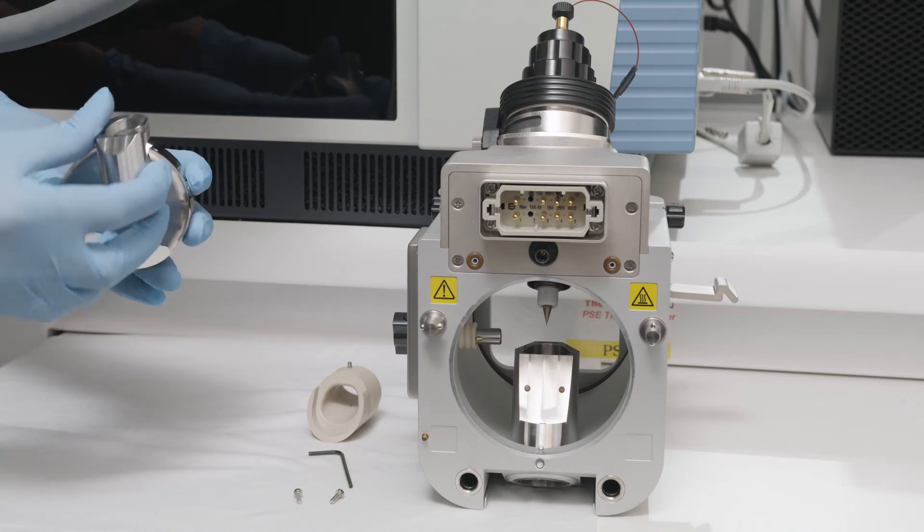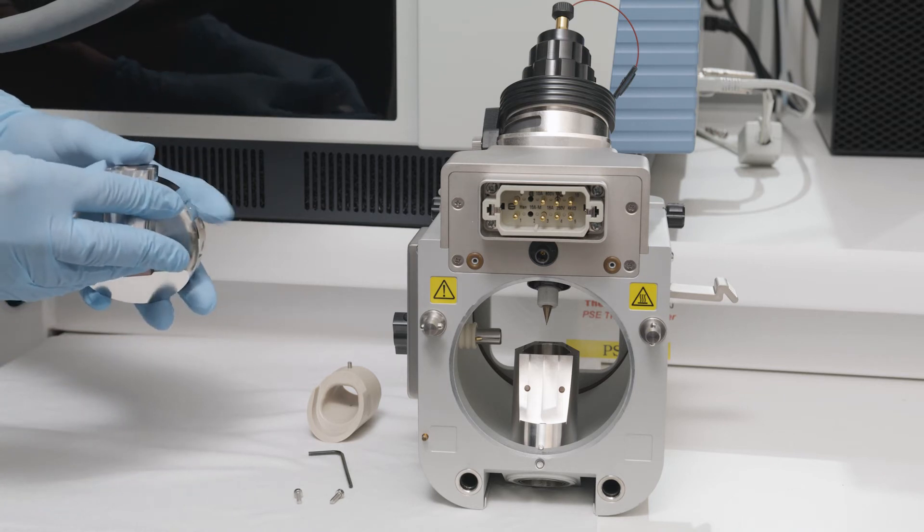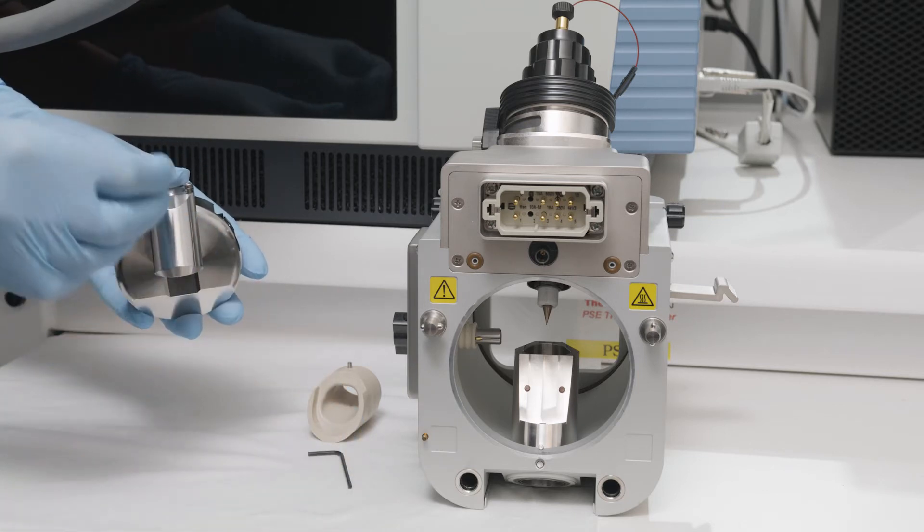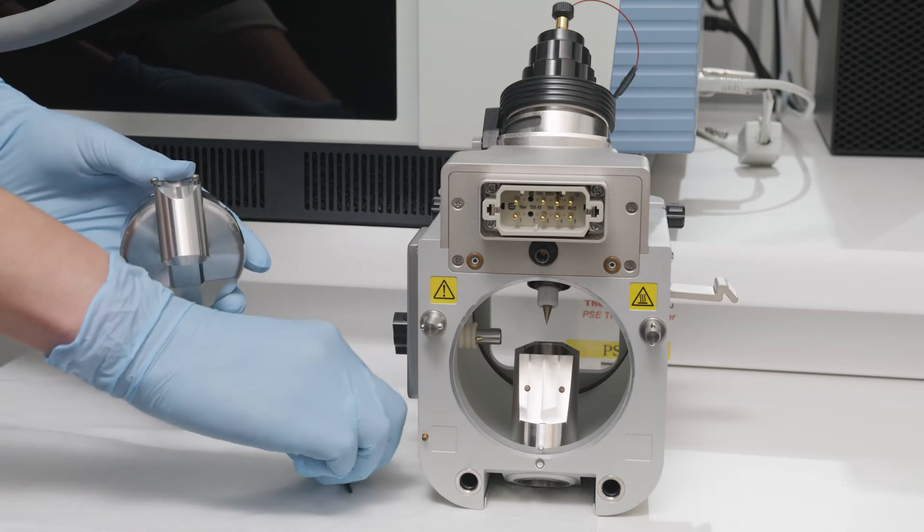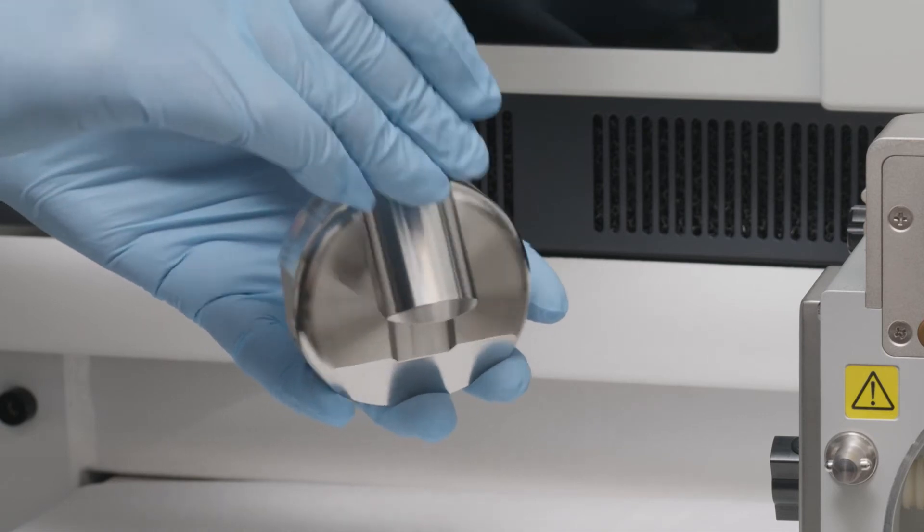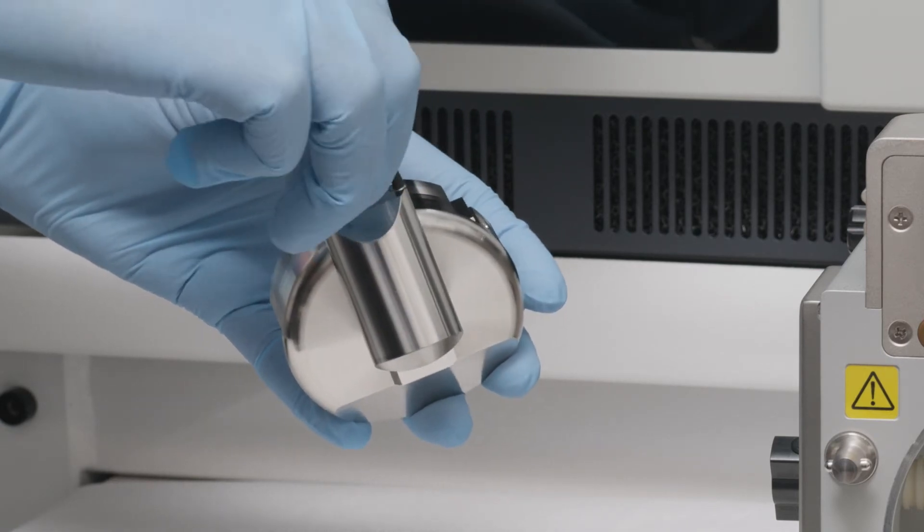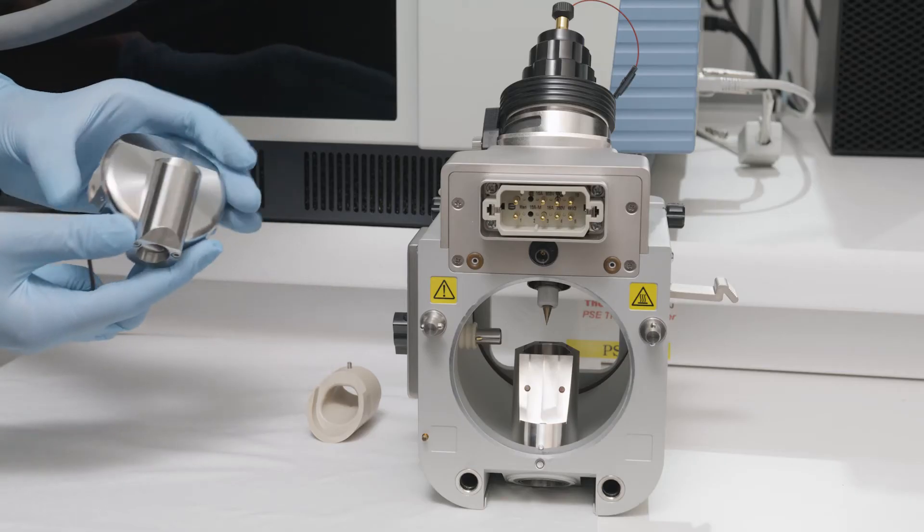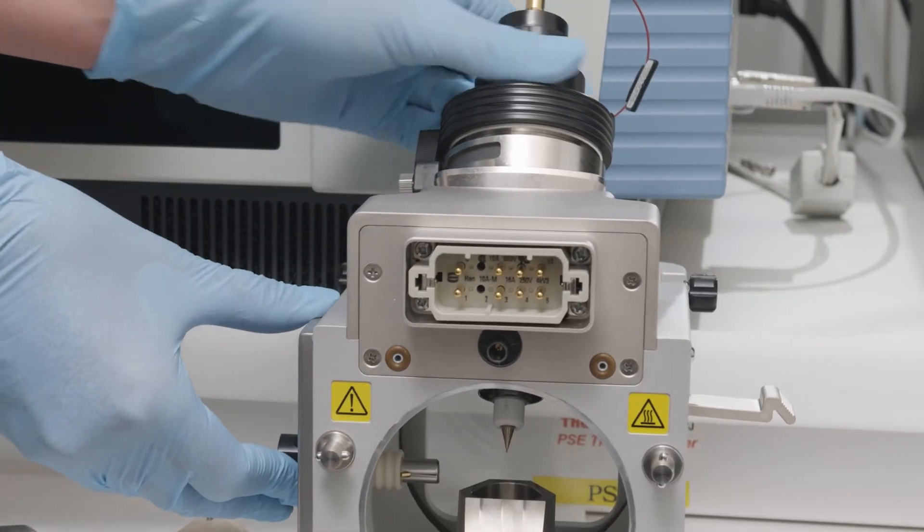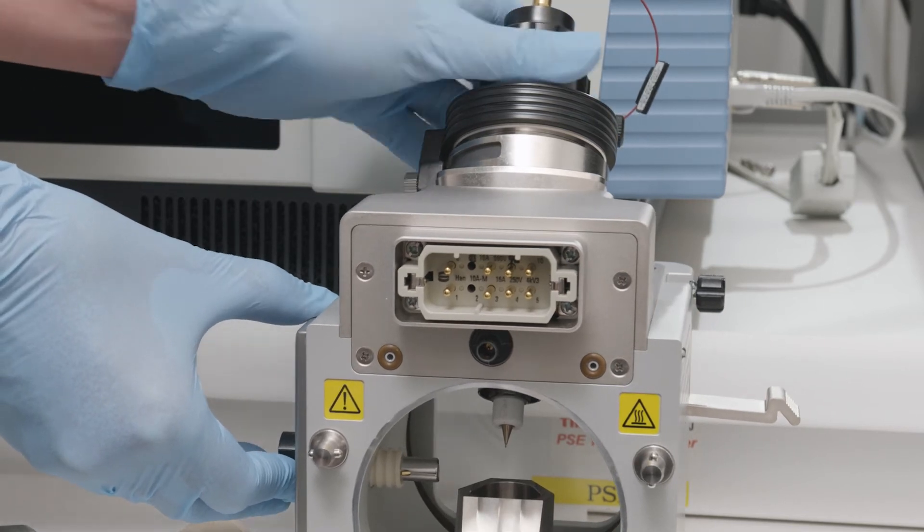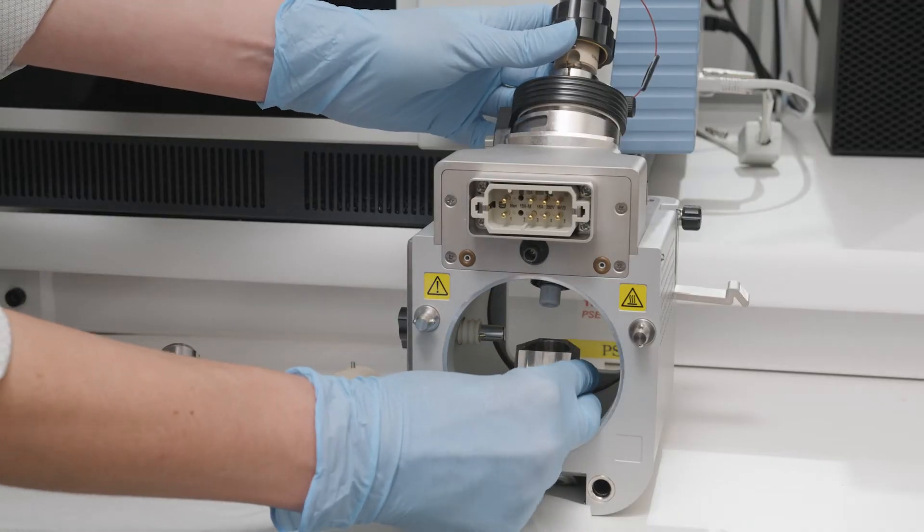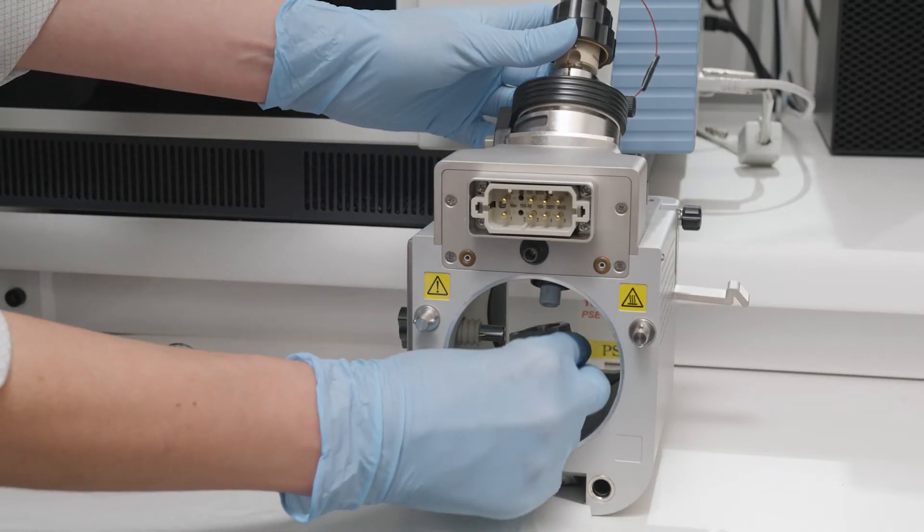Use the two supplied screws and two-millimeter hex key to attach the upper FAIMS drain part to the electrode assembly. Remove the sprayer before removing the drain insert. You can then lift out the original lower drain part and replace it with the lower FAIMS drain part.